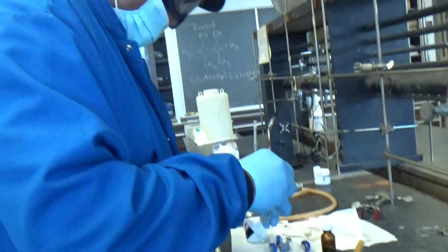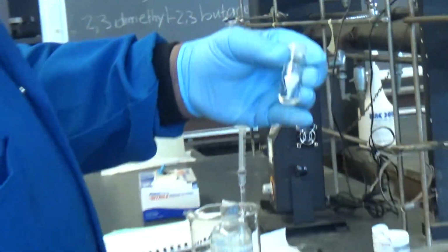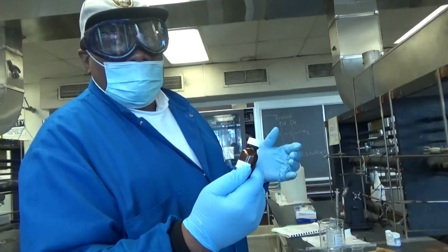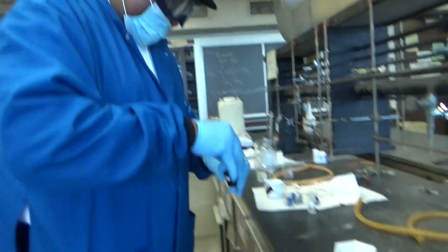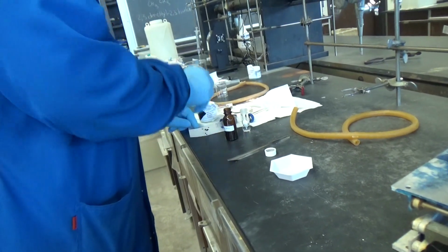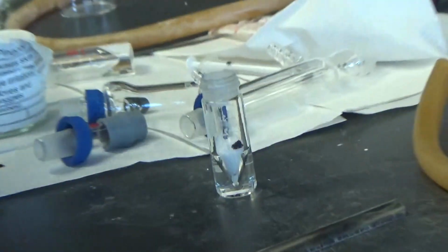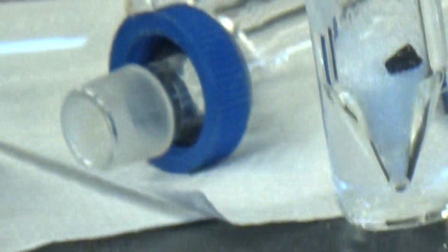I'm going to add it here. All right, you dump it in. I'm also going to add the boiling chip. A boiling chip is basically a boiling stone, but because it's so small, we call it a boiling chip. It's a porous surface with a bunch of little tiny holes, and they cause bubbling. That little thing prevents out of control boiling.